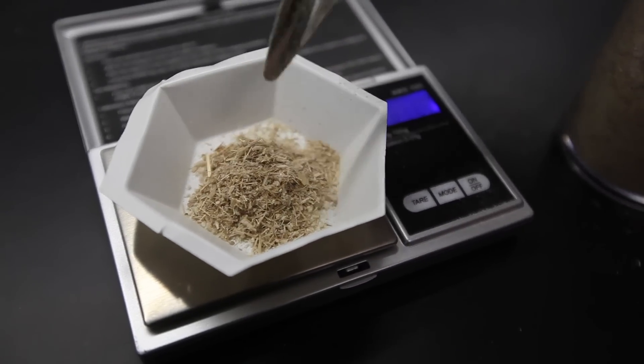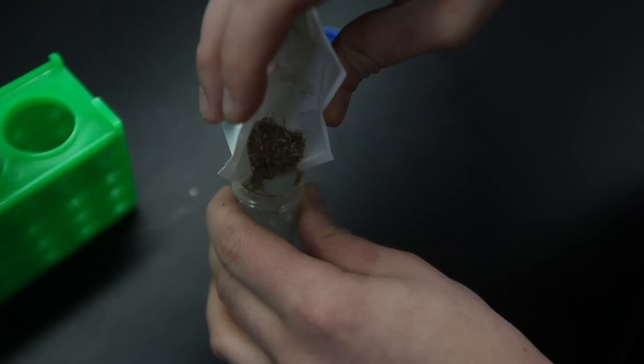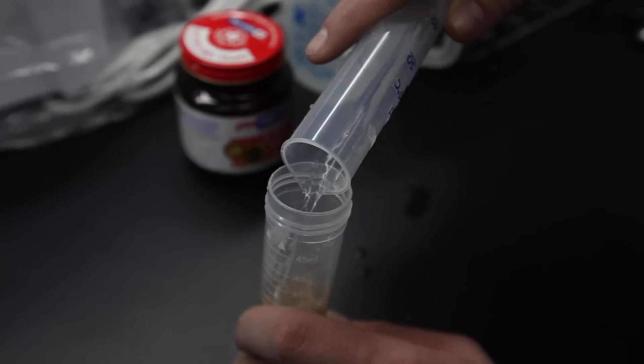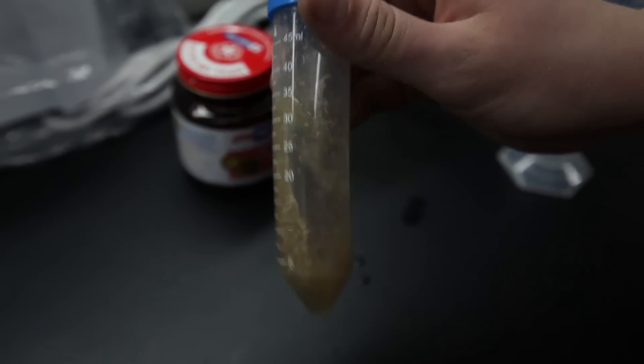The next thing to do is to weigh out roughly a gram of biomass and add it to the test tube. Also measure 25 milliliters of water and add that as well. Cap the tube and shake it thoroughly.